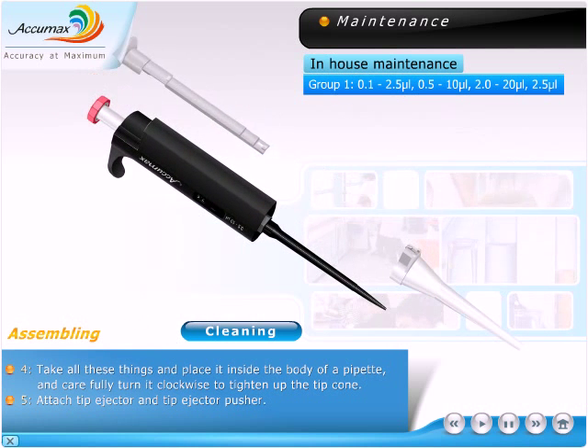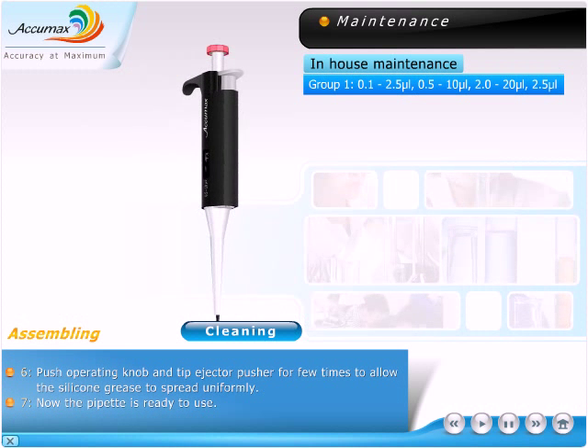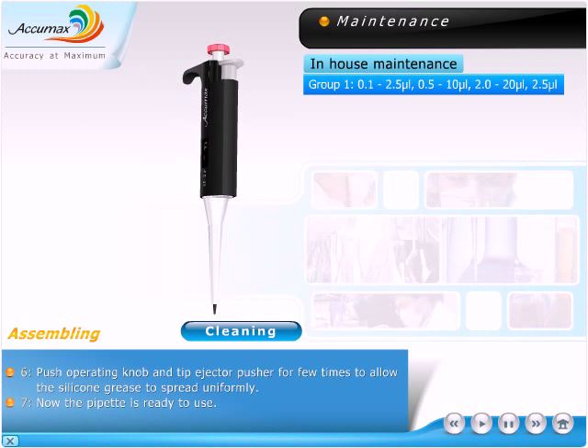Attach the tip ejector and tip ejector pusher. Push the operating knob and tip ejector pusher a few times to allow the silicone grease to spread uniformly. Now the pipette is ready to use.